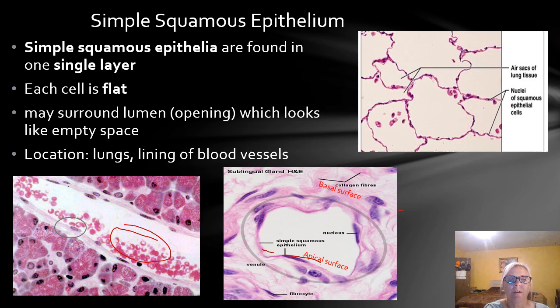And so this layer here with the dark spots, that is the epithelium, okay? And so, like I said, you're going to be looking at multiple types of tissues because our tissues are joined together. They're not usually just one type in a picture. Sometimes they are, but usually not. So you need to be able to look at these and know what you're trying to identify.